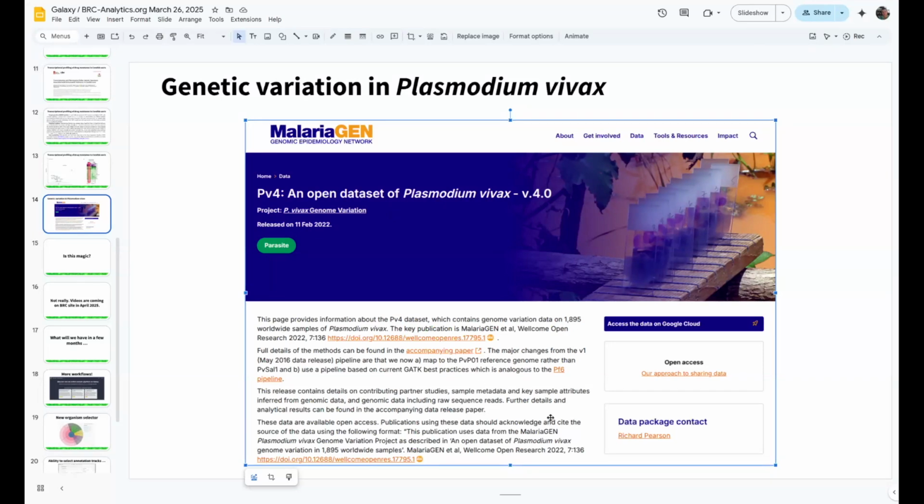So another thing, which actually surprised me a little bit, is that MalariaGEN uses a pipeline based on GATK, which is not exactly an ideal tool for calling variants in this particular pathogen. So I just wanted to reanalyze, essentially rerun, their data using a more appropriate variant caller. And the way I've done this was like this.